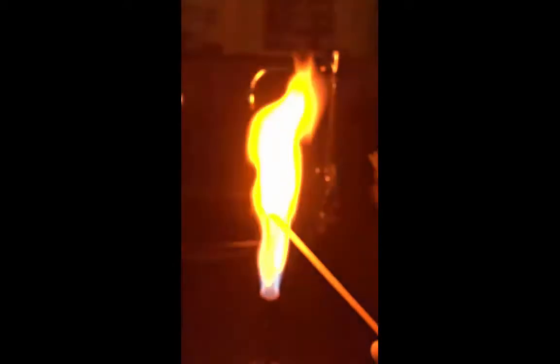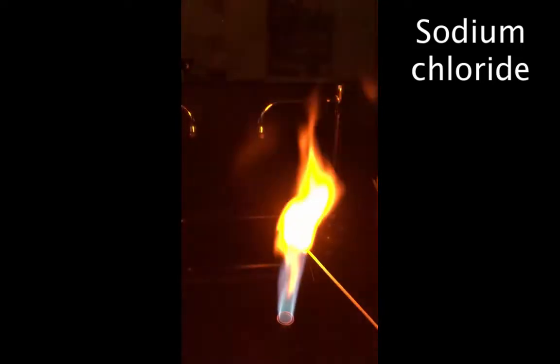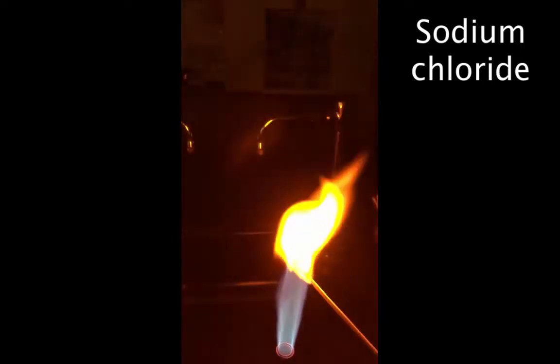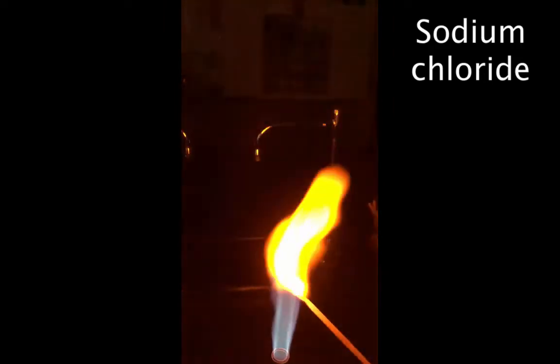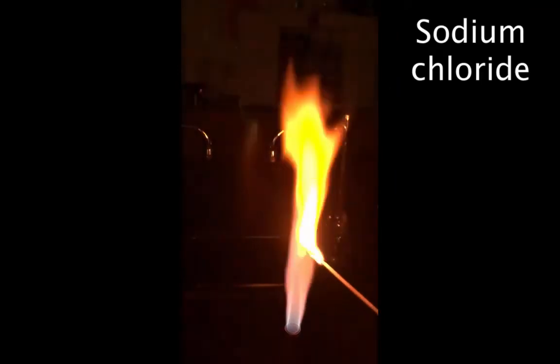Now I'm going to dip the wooden splint into sodium chloride and hold it in the flame. This one is a kind of yellow orange color — I'm burning the sodium. It's the metal within the sodium chloride, so sodium is the metal that I'm actually burning when I put it into the flame.